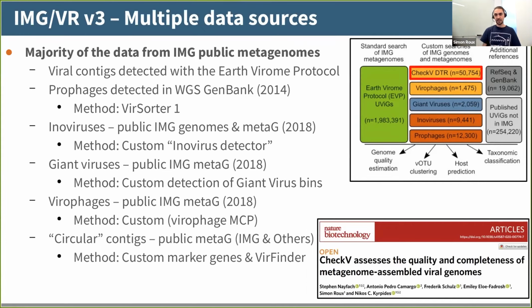And then finally, for anyone who has looked deeply into the CheckV manuscript, which I will come back to as a tool, it does use a custom database of predicted complete genomes, meaning what I tend to call circular contigs, which Stephen is right, should be called contigs with direct terminal repeats. It's basically a contig with identical ends, which usually signs a complete genome being assembled in one piece. And these complete genomes are very important for CheckV as a tool.